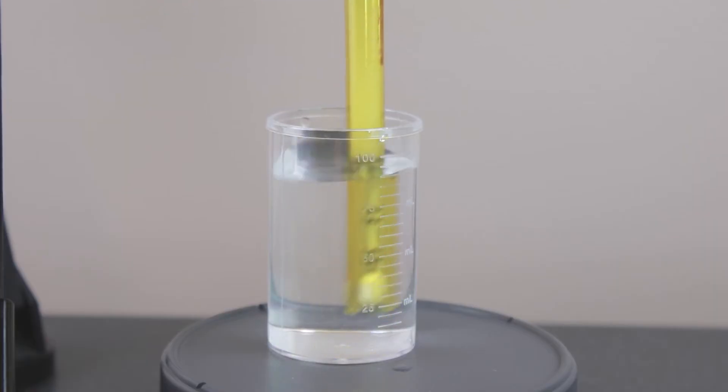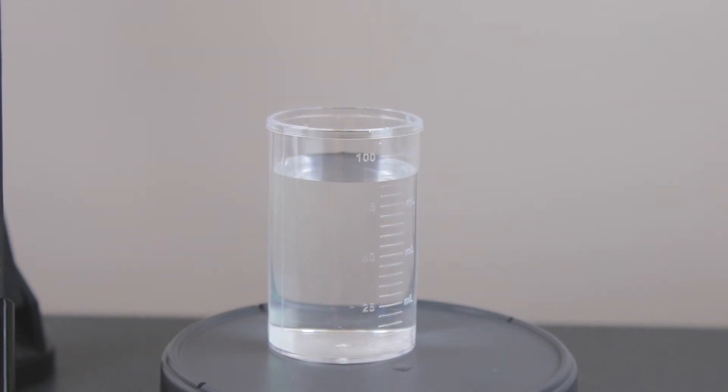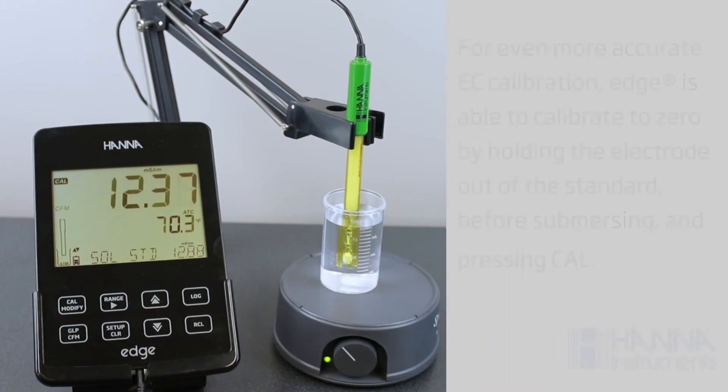Press CAL to enter calibration mode, then rinse the electrode in your first beaker with your standard, then submerge it into the second beaker for calibration. It's best to use a magnetic stirrer for the most accurate readings.